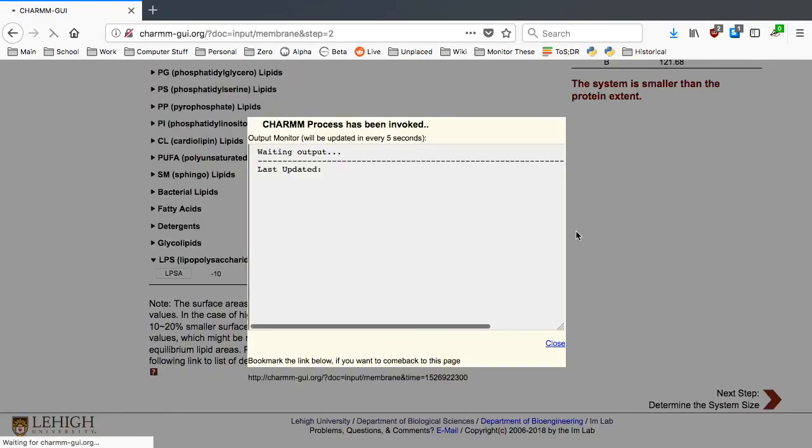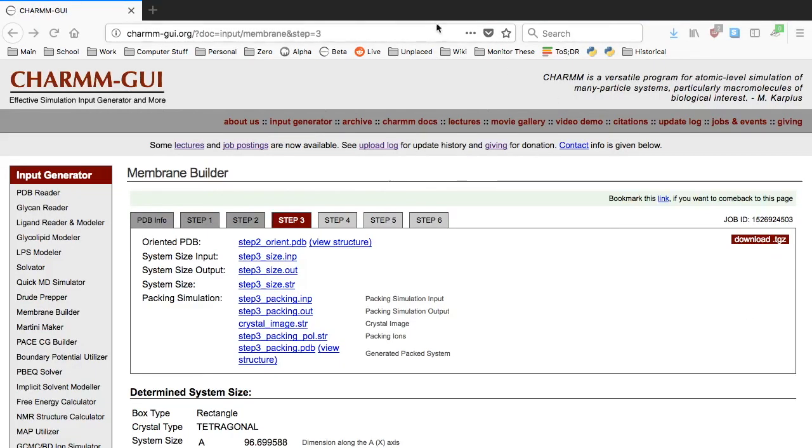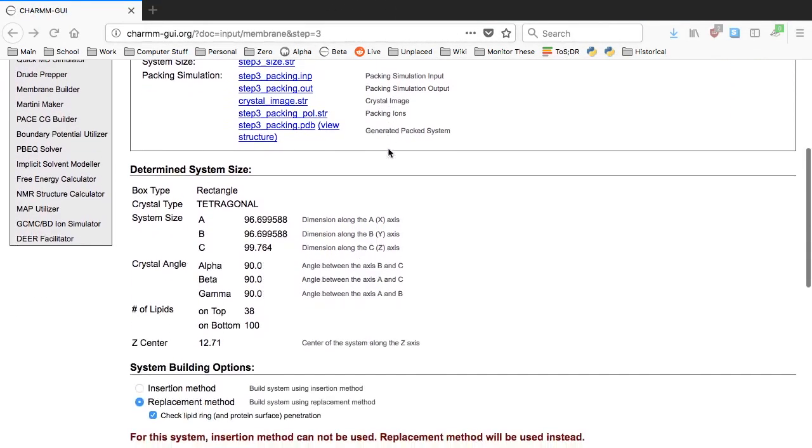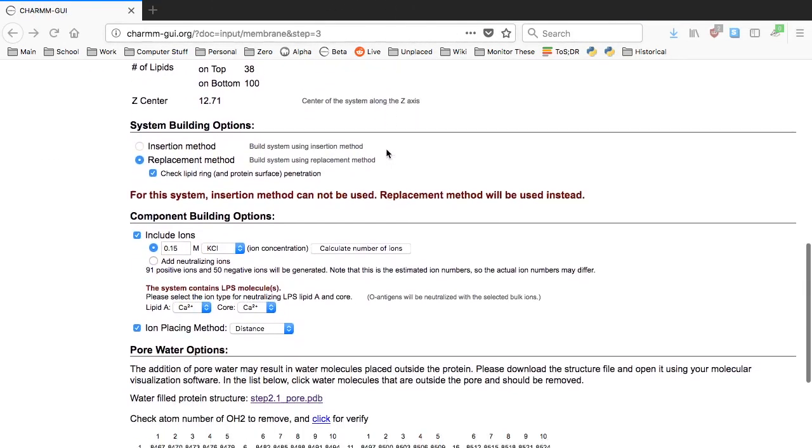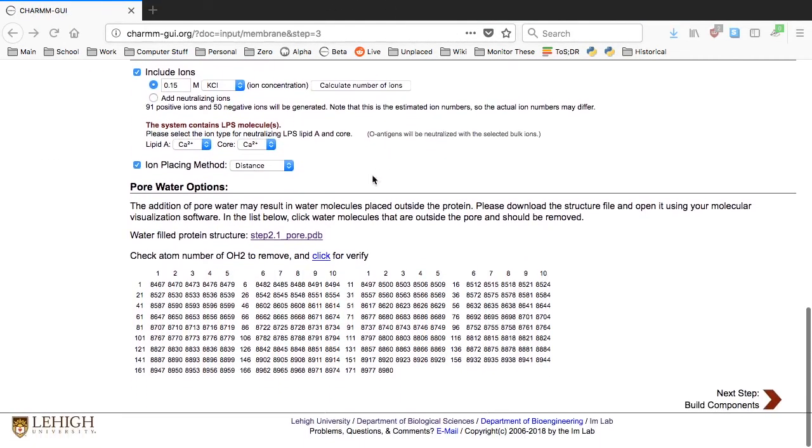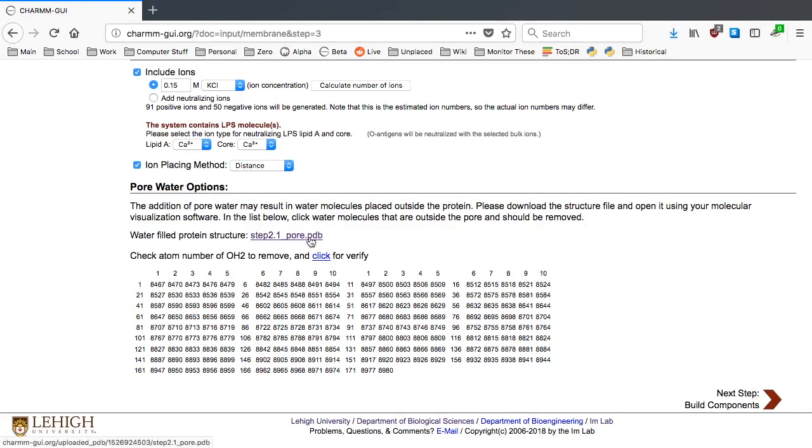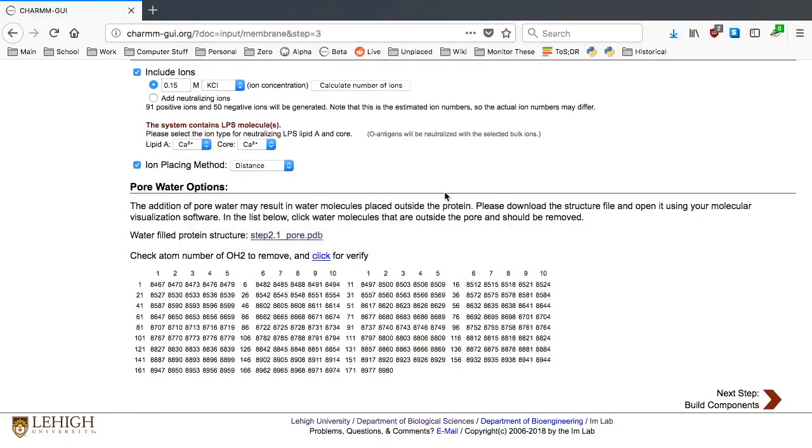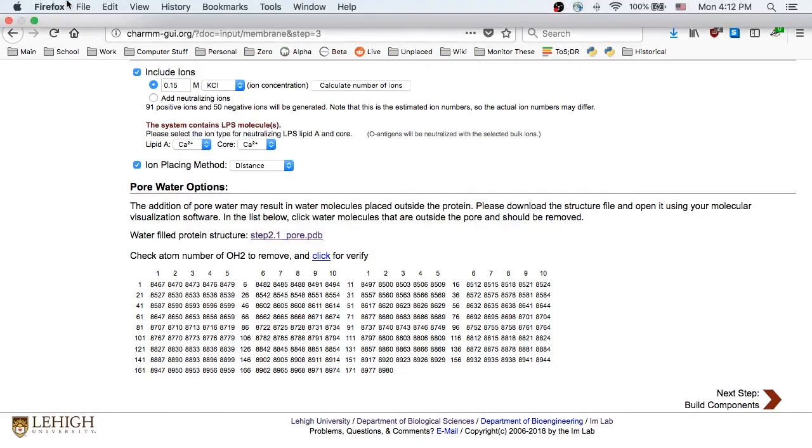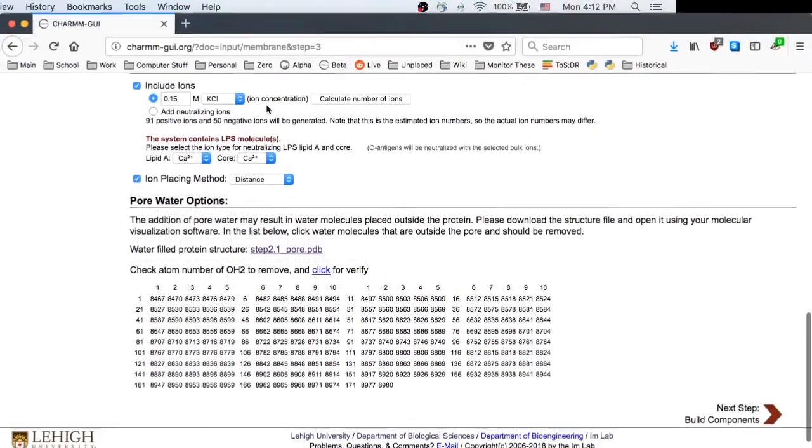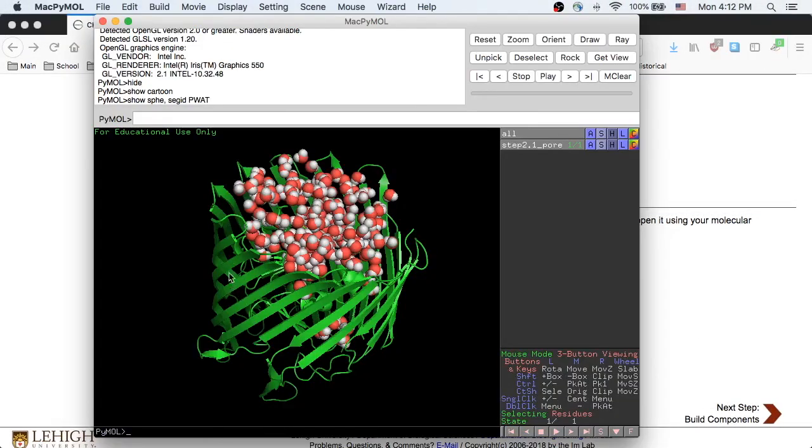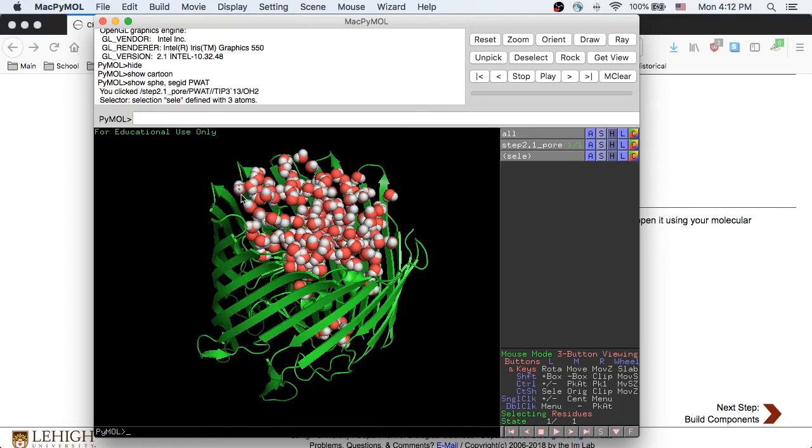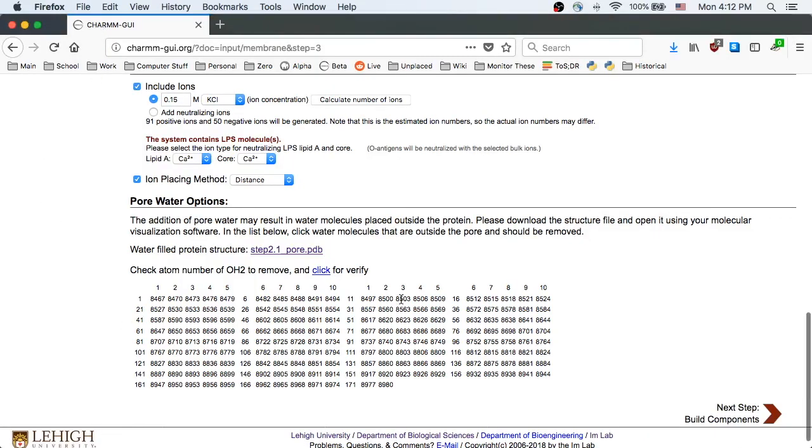In step 4, you can remove pore water molecules if their position is not appropriate. You can download the water-filled protein structure by clicking step 2.1, pore.pdb, and check the position of pore water molecules. For example, if you don't like this water molecule to be here, remember the atom index of the oxygen atom and activate its number in the table.